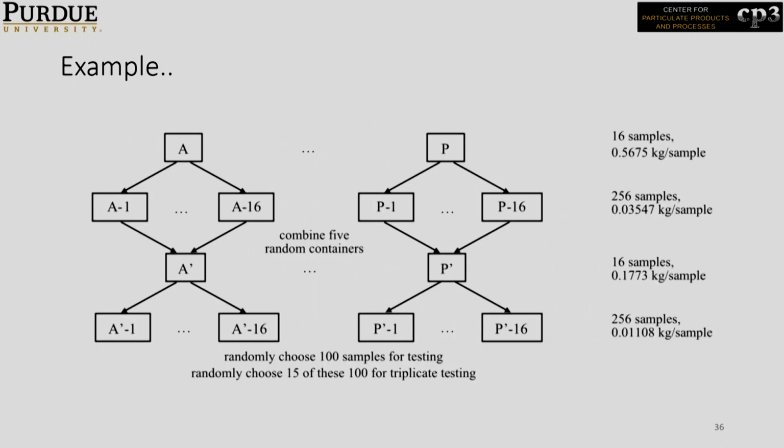So for subsampling, we always suggest, for anyone going into the industry, one of the first things you will have to do is develop a sampling protocol. Most of the industry may not have a sampling protocol, for how you sample powders. Okay.